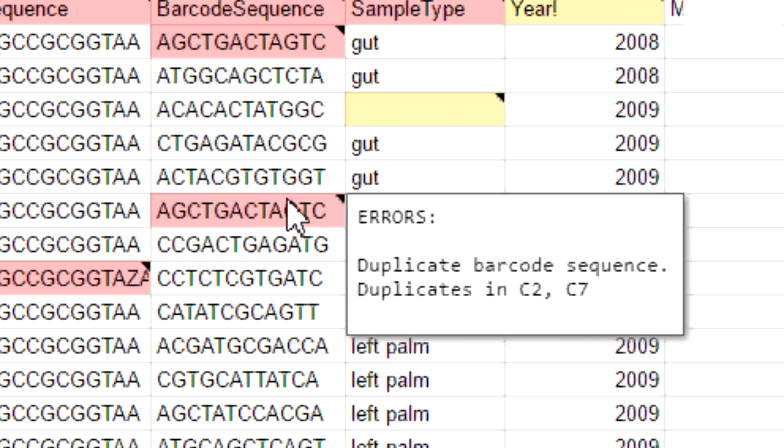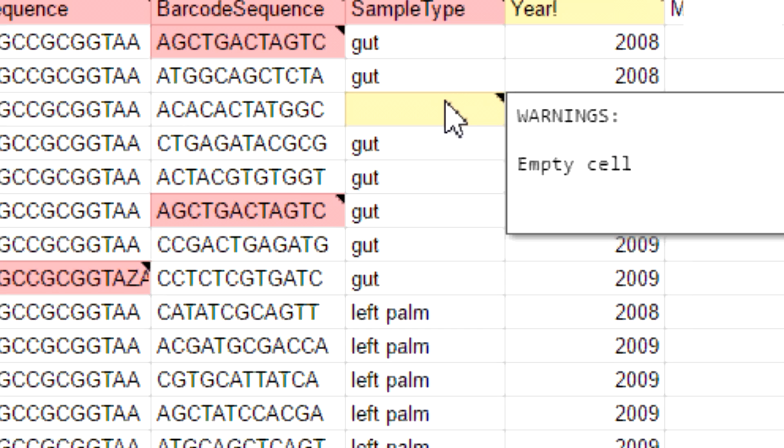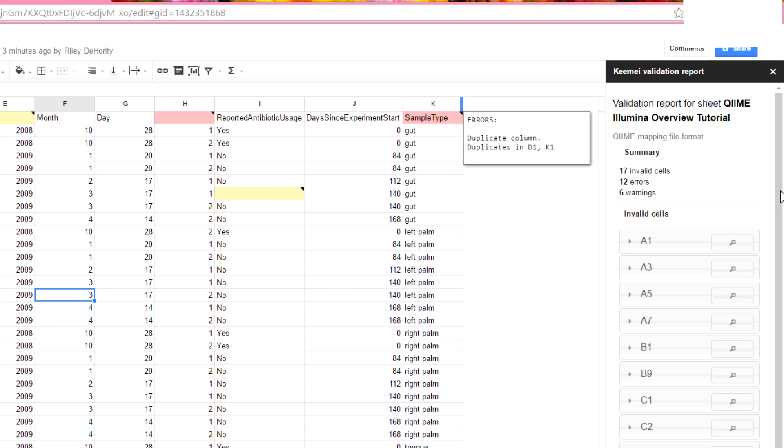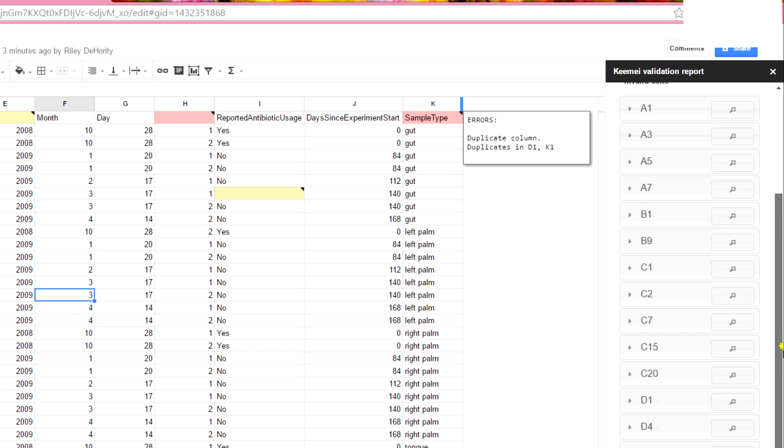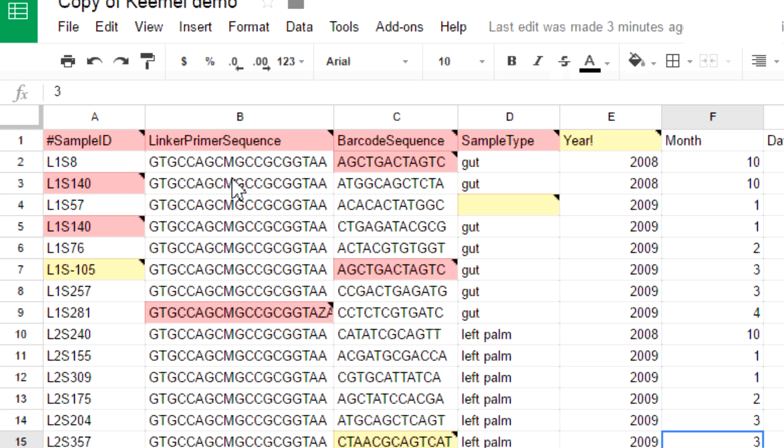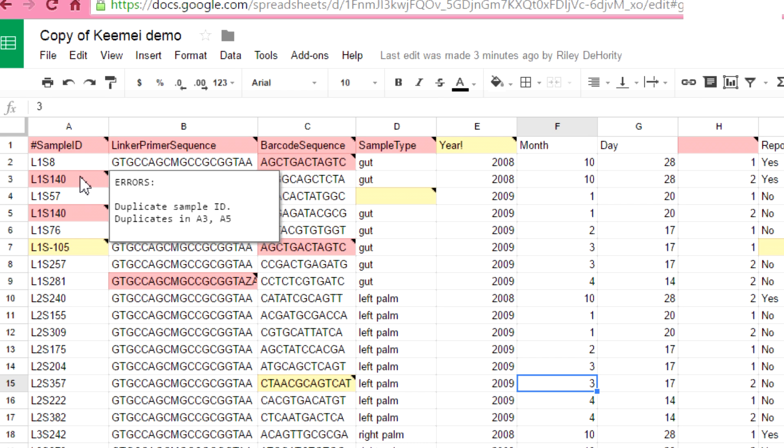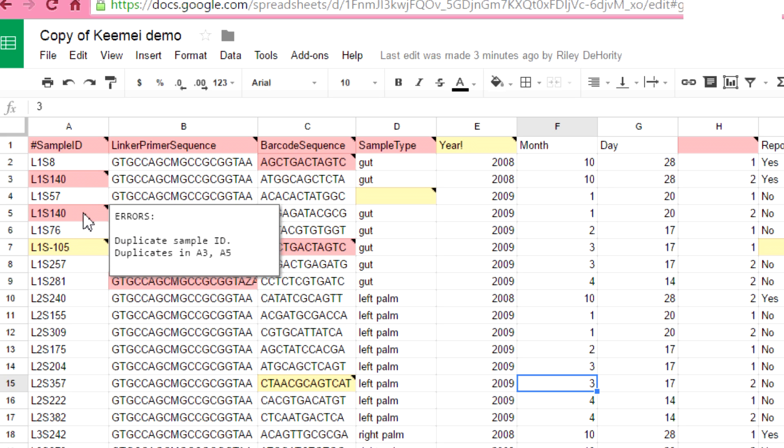So the way the colors work is, cells that are red have errors, cells that are yellow have warnings. And here on the side is the validation report. It's got a summary of all of the errors that it found and information about each cell that came up. For example, let's hover over A3, cell A3, and it says that there's a duplicate sample ID in A3 and A5, which is obviously true.